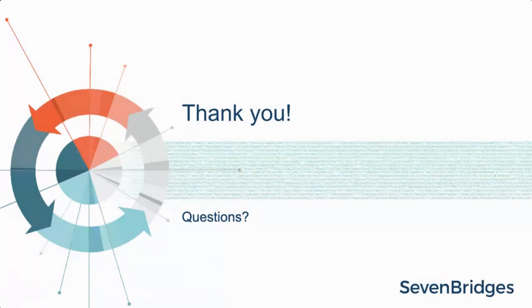What are the benefits and trade-offs of the regular aligners versus the pseudo-aligners? Okay, so in general, regular splice-aware aligners are used to map reads to mostly the genome reference, so you are able to identify potentially new isoforms, and they are more precise when identifying, for example, mutations, SNVs, and so on.